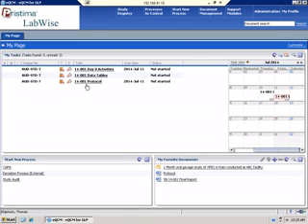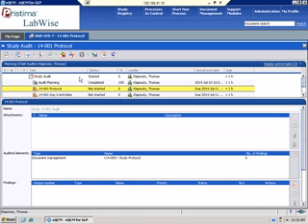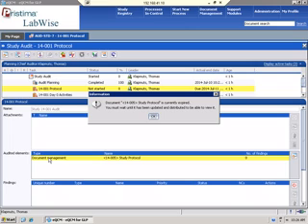From here, I can just go ahead and click on my audit task. Again, it opens up the process, so you can see here the audit planning is completed, and now I'm on to my protocol audit task. If there were any attachments, I'd be able to click on them and view them. My audited element is my protocol, so here I can double click, and I picked the wrong protocol.